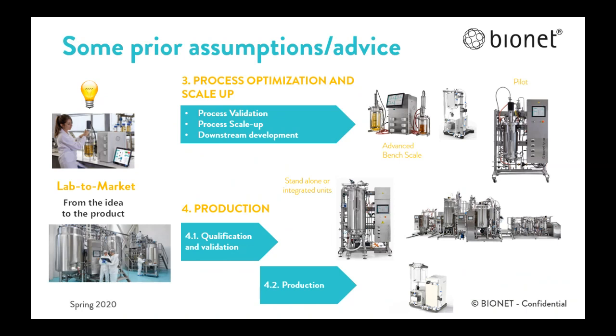Shelf-life and storage stability standards. Determining possible byproducts or waste streams requiring treatment before discharge. Providing data that can be used in making a decision on whether or not to proceed to a full-scale production process, and in the case of a positive decision, designing and constructing a full-size plant or modifying an existing plant.